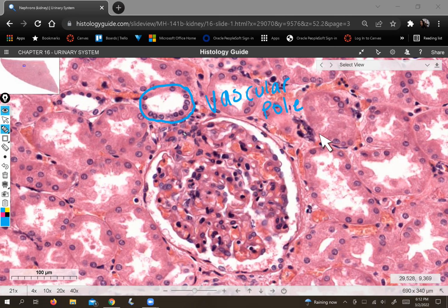We'll discuss those. The other end of each corpuscle, which unfortunately you can't see here, it's really hard to get a slice that includes both, but I can show you the urinary pole in another spot. If it was present here, what you would see would be an opening like so, and then the tube immediately off of it would be the proximal convoluted tubule. So the urinary pole is the end of the corpuscle that the filtrate exits into once it's formed. So those are the terms that you'll see, and I wanted to give you some context for that.